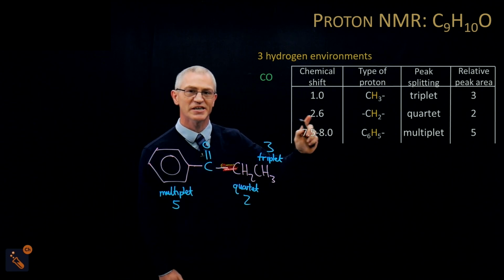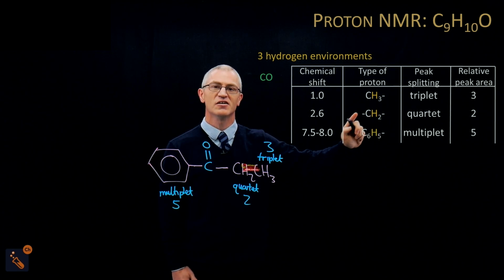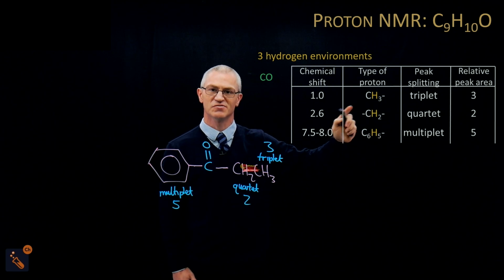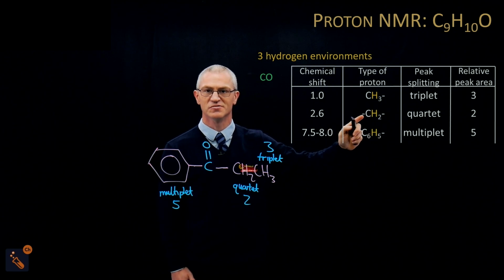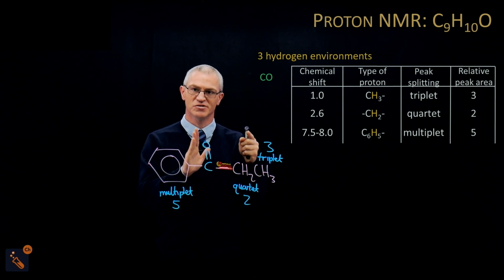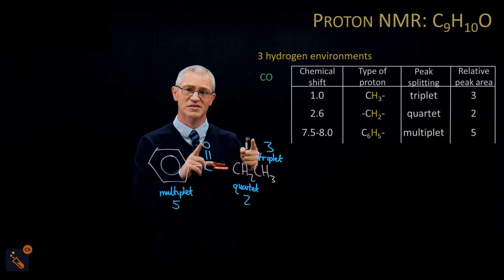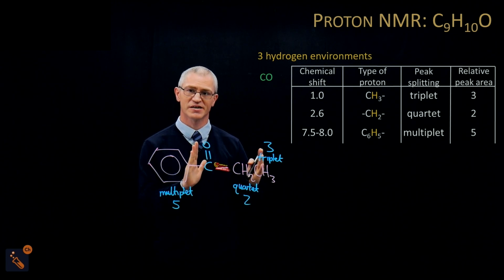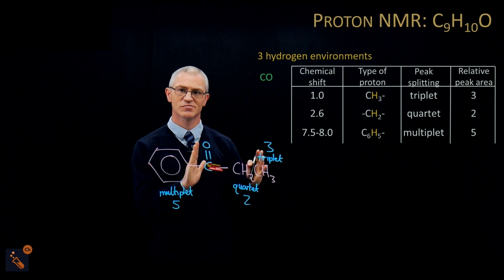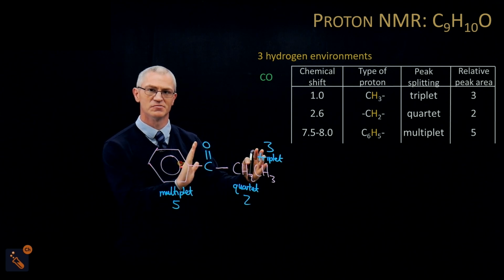Also, if you want to make it completely unambiguous, that's the really important thing, so that they know that you know which carbon with which hydrogens gives rise to the signal. Often it's good to take a section out of this to show which one it is, especially if you have more than one CH2. So, for example, if I want to make this abundantly clear, I can take out this section here, which is the C double bond O, and our CH2.